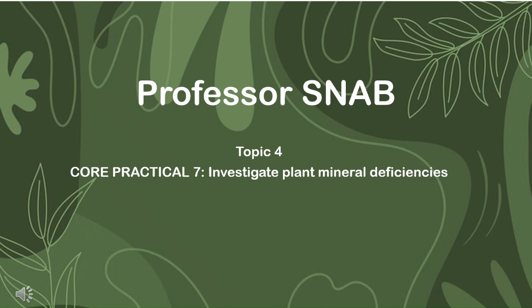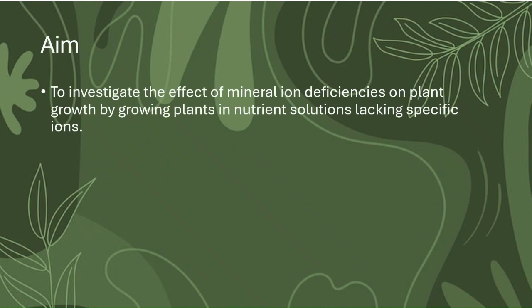So today we're understanding and looking at a core practical in which we'll investigate plant mineral deficiencies. So the aim of this investigation is to look at the effect of mineral ion deficiency on plant growth by growing plants in nutrient solutions lacking specific ions.